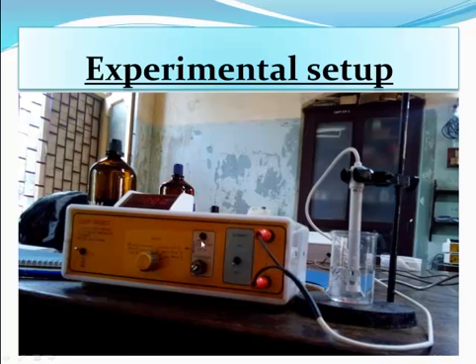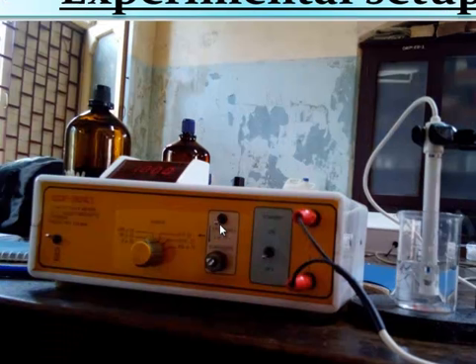Obviously, you can see out here that the standardization switch is still down and as a consequence, the display shown out here will not budge from 1.000, although there is a solution in which the probe is dipped. So basically, the conductometer is not responding to the probe and showing a reading of 1.000 millimhos or millisiemens. So before we start the experiment itself, we need to put this knob up.